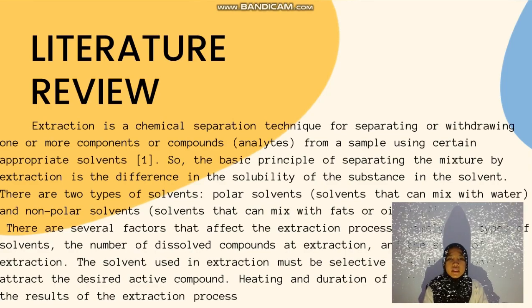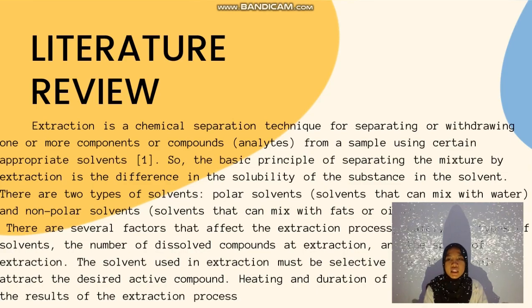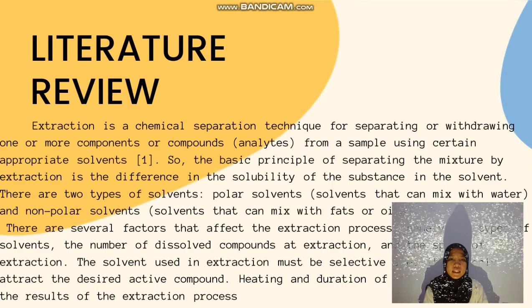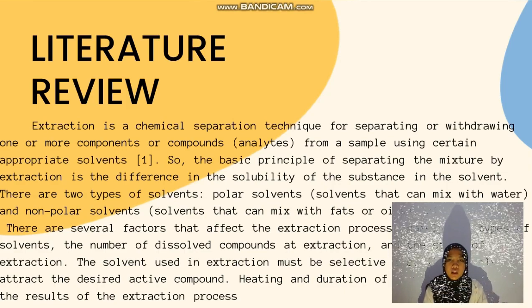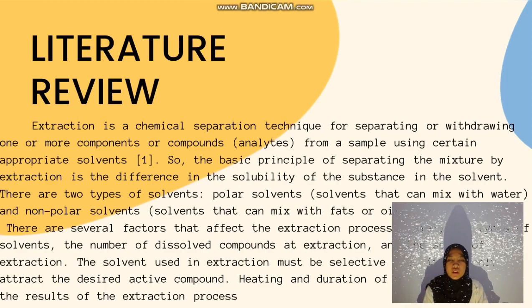The basic principle of separating a mixture by extraction is the difference in the solubility of the substance in the solvent. There are two types of solvents: polar solvents, or solvents that can mix with water, and non-polar solvents, which can mix with fat or oils.